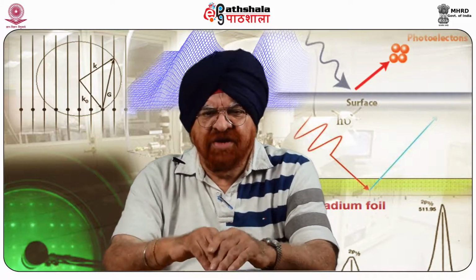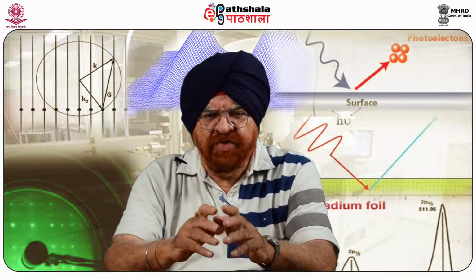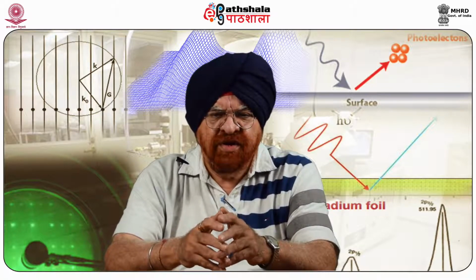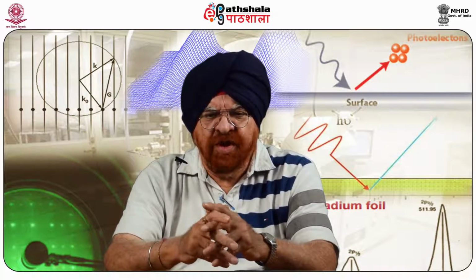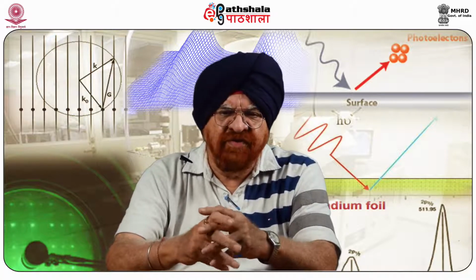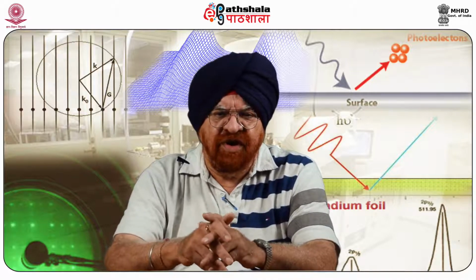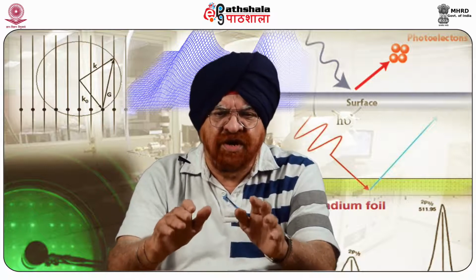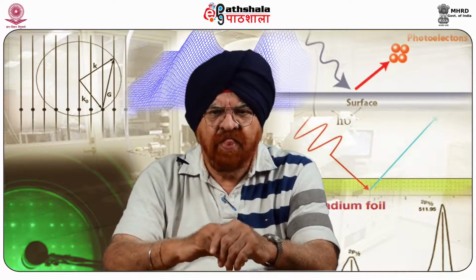Before that, the actual potential was not realized. In 1967, Siegbahn published a comprehensive study of XPS, bringing instant recognition of the utility of XPS. Siegbahn received the Nobel Prize for Physics in 1981 to acknowledge his extensive effort in developing XPS into a useful analytical tool, to be precise, a useful surface analytical tool.